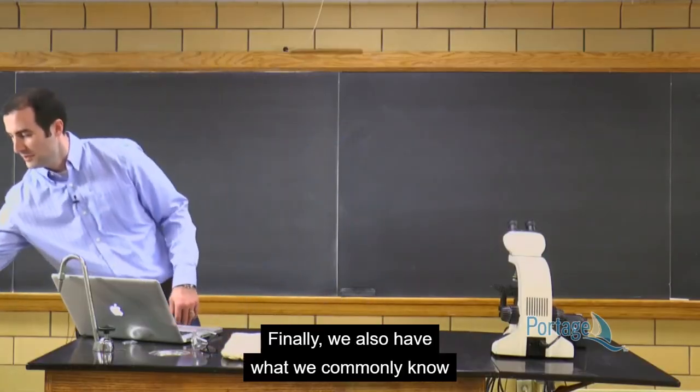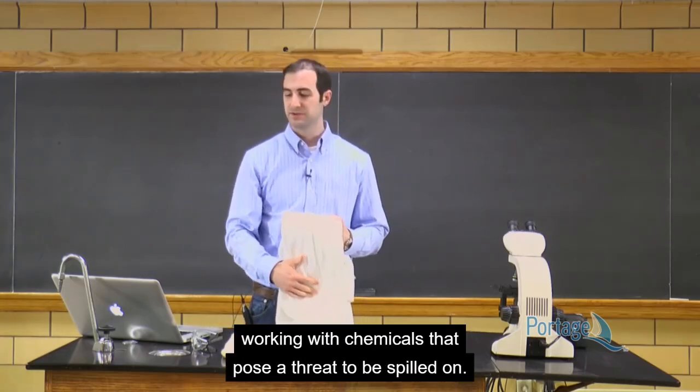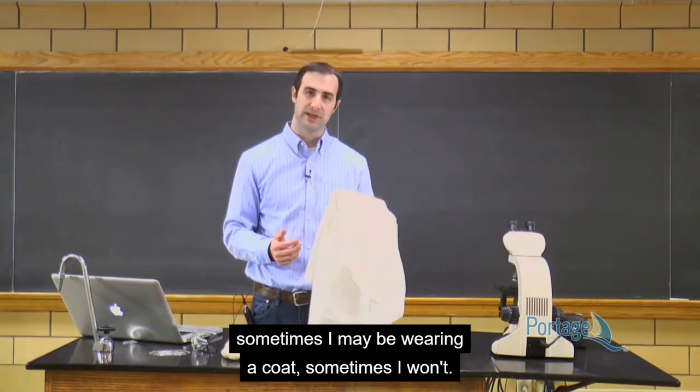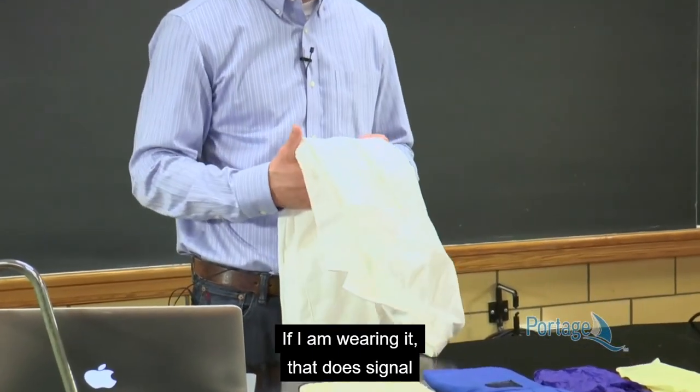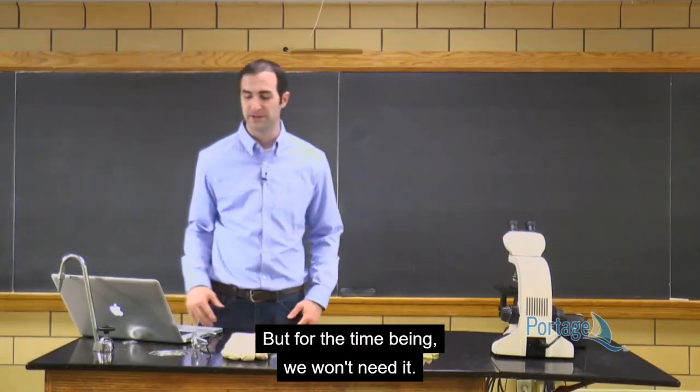Finally, we also have what we commonly know as the great white lab coat. This should be worn whenever you're working with chemicals that pose a threat to be spilled on. You'll notice during the course of these lectures, sometimes I may be wearing a lab coat, sometimes I won't. If I am wearing it, that does signal that if you're in the lab, you should also have one on. But for the time being, we won't need it.